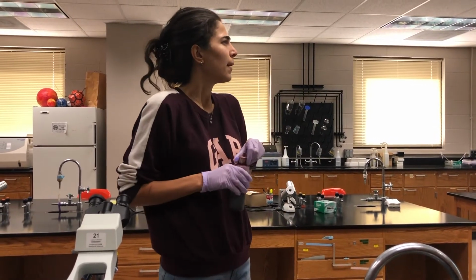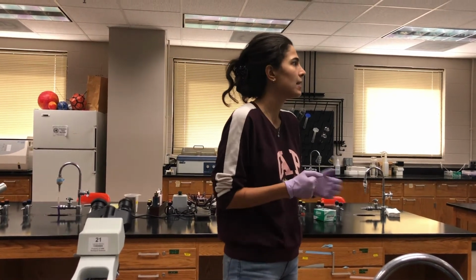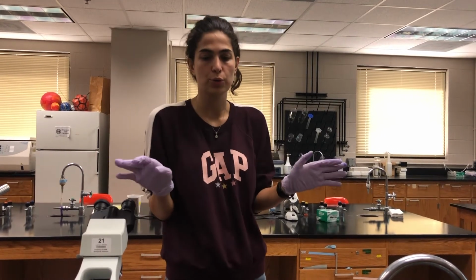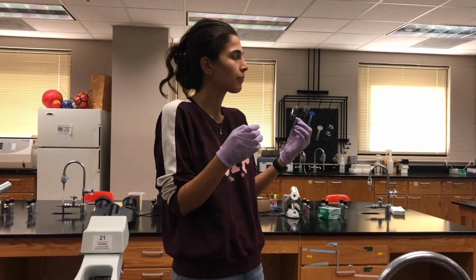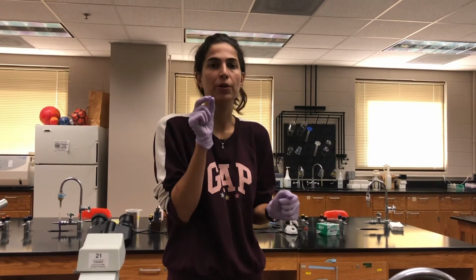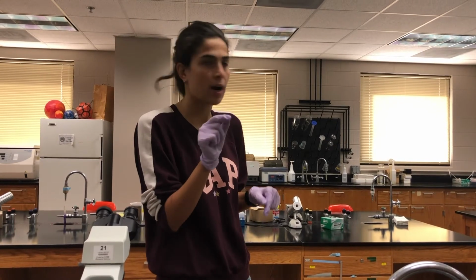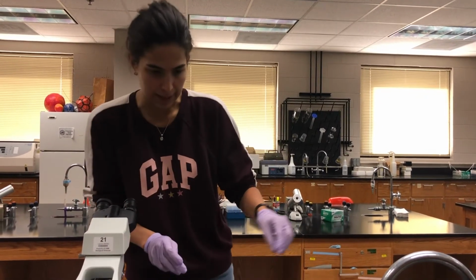So after we are doing that, the thing which is really important is after we wash it with everything, we wanted to keep our smears, right? In order to do that, we need to blot dry with paper towel. 1 minute is done. Let me just rinse it with water, and then I will explain to you more.